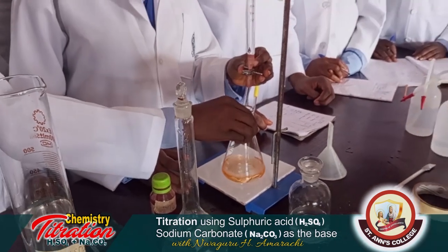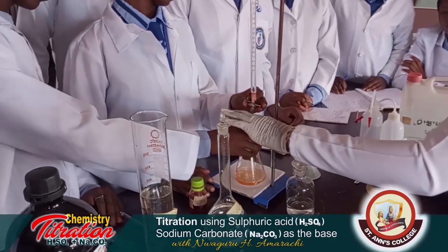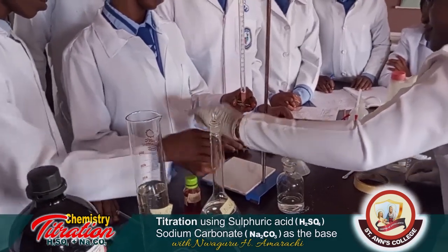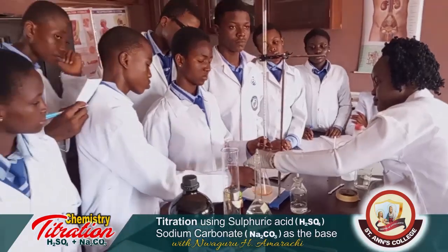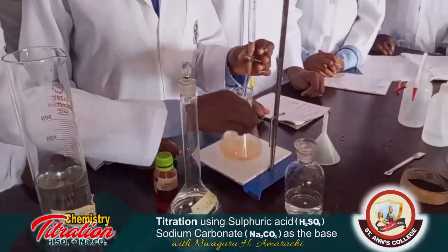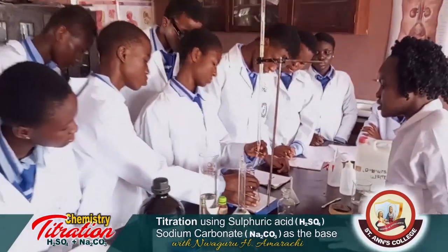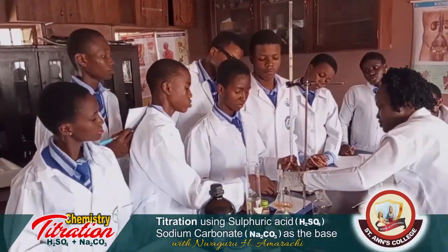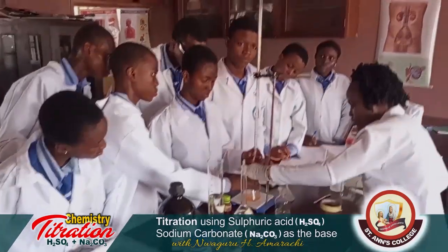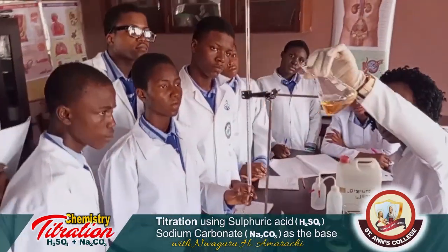You can pause to view the color change. Pause. View the color change. As you can see, a clear color change now.